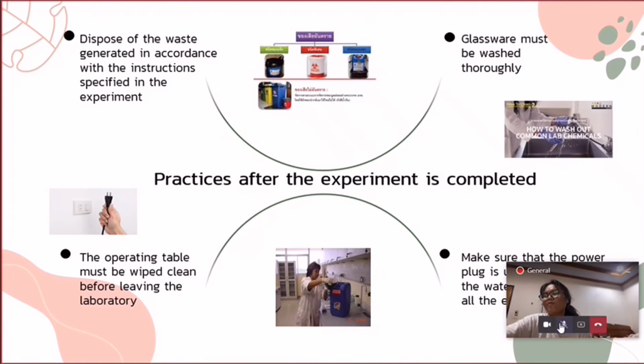Dispose of the waste generated in accordance with the instructions specified in the experiment. Glassware must be washed thoroughly. Make sure that the power plug is unplugged and packed. Shut off the water valve and put all the equipment in place. The operating table must be wiped clean before leaving the laboratory.